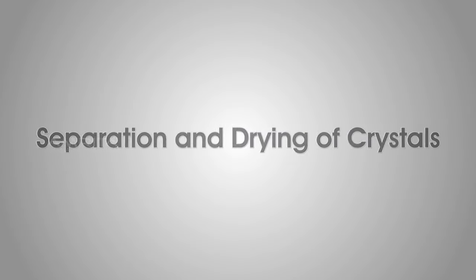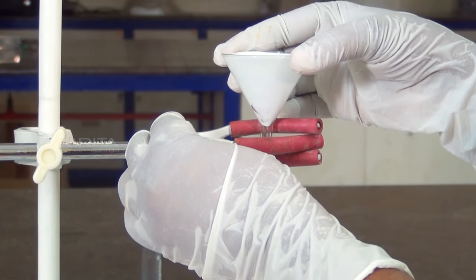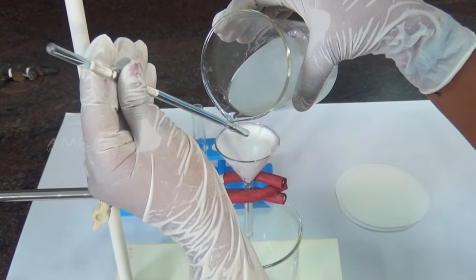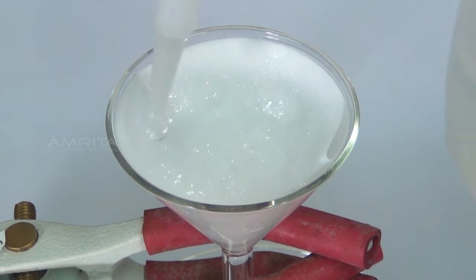Separation and drying of crystals. Clamp the funnel in which a filter paper is fixed to the stand. Place a beaker under the funnel and separate the crystals by filtration. Wash the crystals with cold water.